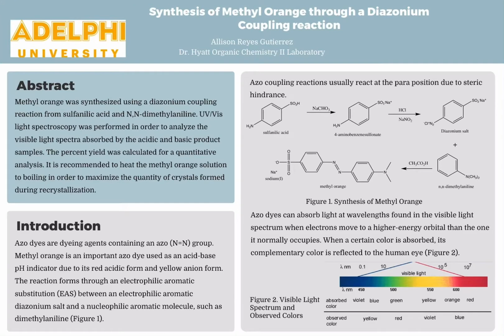Good morning, everyone. My name is Allison Reyes Gutierrez, and today I will be discussing the synthesis of methyl orange via a diazonium coupling reaction, an experiment conducted under Dr. Hyatt's guidance for the Organic Chemistry 2 lab.